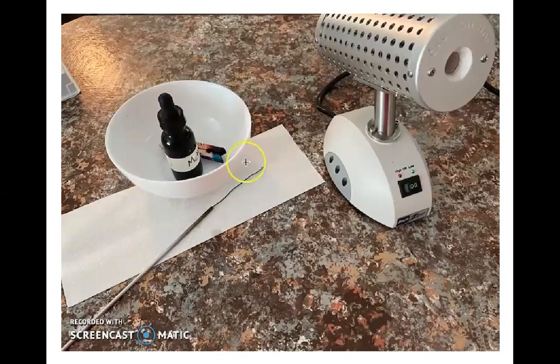If you remember when you were a little kid and you used to play with soap bubbles, you would stick that little wand down into the soap bubble solution and you would pick up some of the solution inside the loop. And that's what we're doing with an inoculating loop as well. Over on the right-hand side over here, you can see an incinerator. This is an electric device that gets hot enough to allow us to sterilize the wire on an inoculating loop.